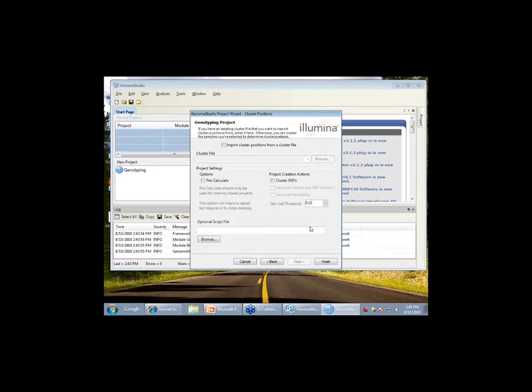And then you get this file, and it asks a couple questions on what do I want to do when I load the data. We want to cluster the SNPs automatically. You can do this later or right now. I just do it right now just because it becomes automatic. So the program can auto-cluster SNPs, and I'll explain what that means once we have it done. The repository was just potato test data, the parent folder. It's the same as the sample data sheet folder.